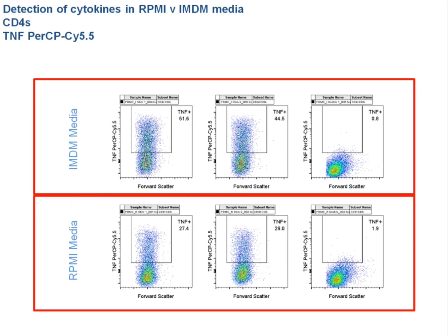it's ultimately a robust technique now, and certainly I use it frequently, where I just thaw out the cells, almost flash thaw them at 37 degrees, and then stimulate them. The only thing you'll really see is you might see somewhat less activation than your fresh cells, and again, many more dead cells. But it's certainly a robust technique.